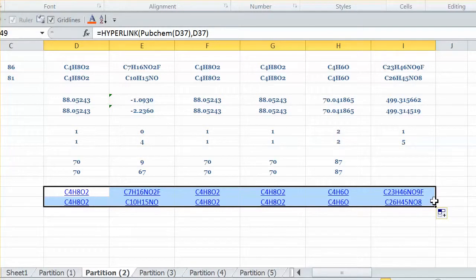And in this case there's only 2 sets of elemental compositions, but for example if we were doing the first one, there's 15 different formulas, so you might want to look at a number of those to see what kind of compounds would fit that formula.